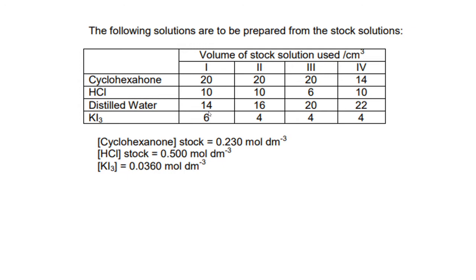Okay, the iodination starts, because you want to monitor that. So the gist of the experiment is, you put all this in a tube and immerse it in the water bath, and have a separate tube with KI3 in there.